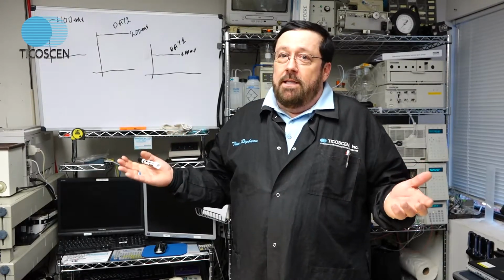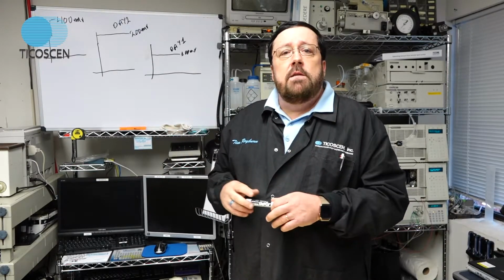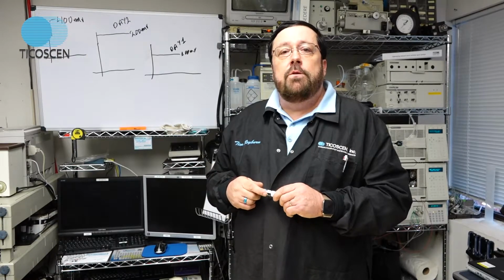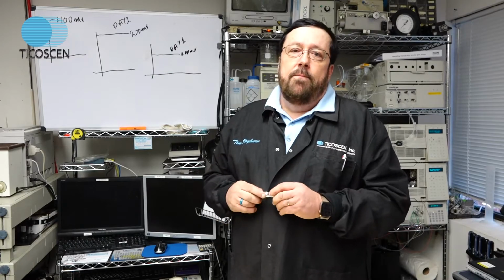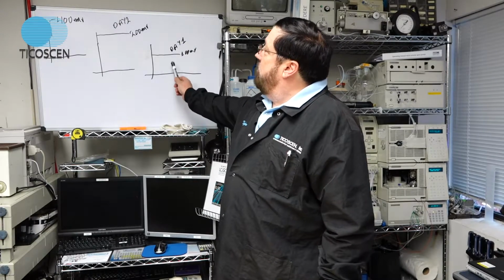Now, not all of my clients will change their water frequently like they should, and I fly up there and I look at their water and there's literally things swimming in the water, and it's just really amazing. They don't see that. So we are working on some UV light solutions to suppress biological activity in the water over time, and that'll be used on HPLC systems hopefully in the very near future. But water is a common issue all the time. I can't tell you how many times you got to watch out for this. So if you're not going to buy a UV lamp, you need to change your water daily.